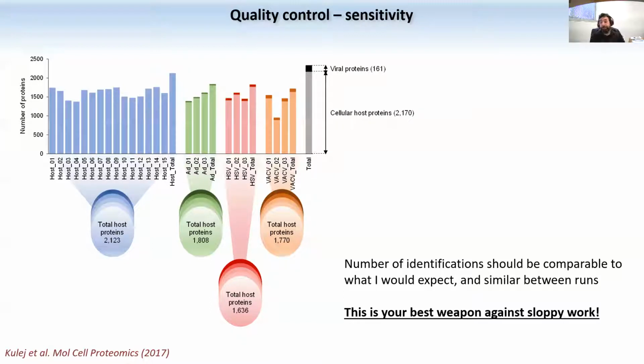Another one is how many proteins do I detect in my experiment X or my experiment Y? So this one seems like an easy check. In reality, the number of proteins you can detect from a sample changes a lot depending on the type of sample that you have. Even if you're working with human cells, there are some tissues and fluids where you can identify 4, 5, 6, 7,000 proteins easily. For example, from a cancer cell, because cancer cells express a lot of proteins. But if you take blood, it's harder to detect more than a few hundred proteins, because in blood, there are some proteins that are extremely abundant, like, for example, serum albumin. And then there are other proteins that are very low abundance. They get suppressed by the albumin. You're not going to be able to detect much more than a few hundred proteins.